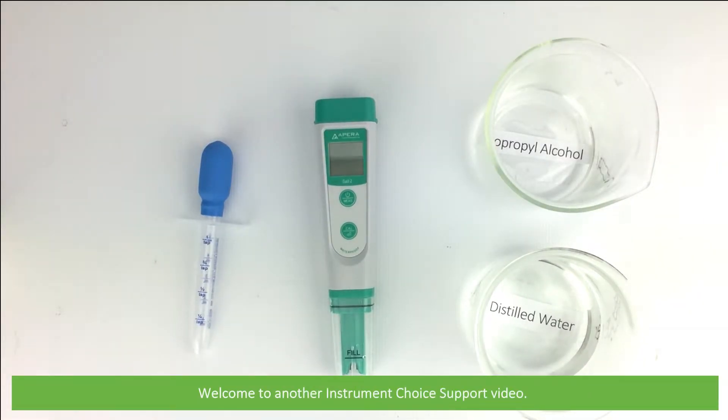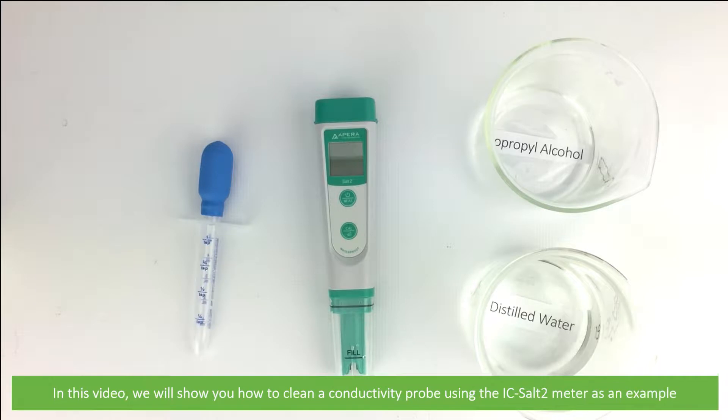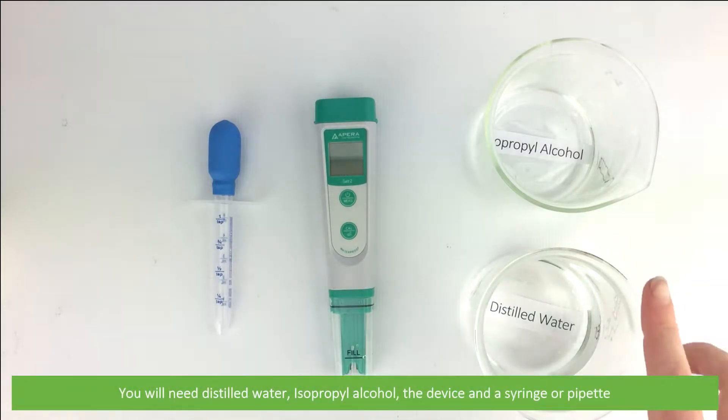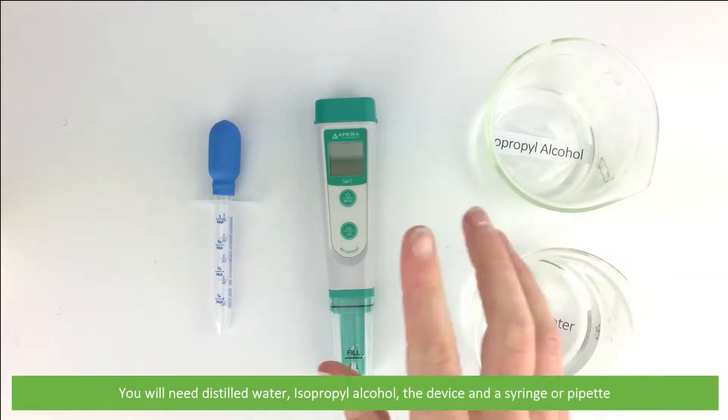Hi and welcome to another Instrument Choice support video. In this video we will show you how to clean a conductivity probe, using the IC-Salt 2 meter as an example. You will need distilled water, isopropyl alcohol, the device, and a syringe or pipette.